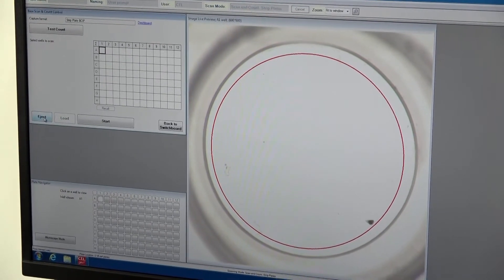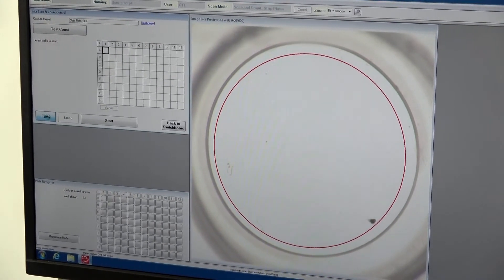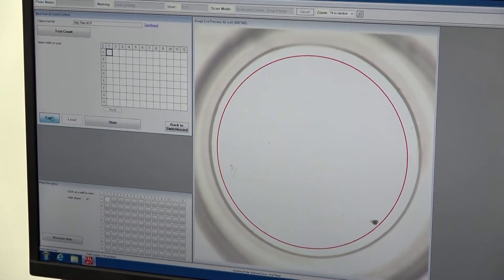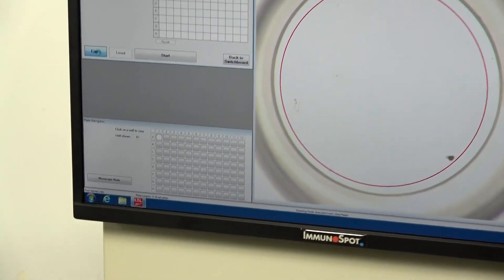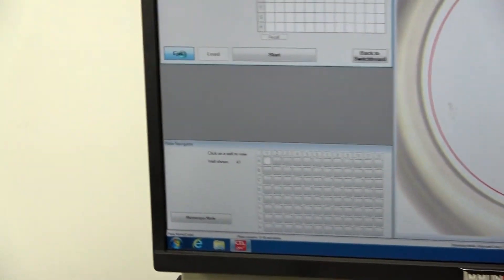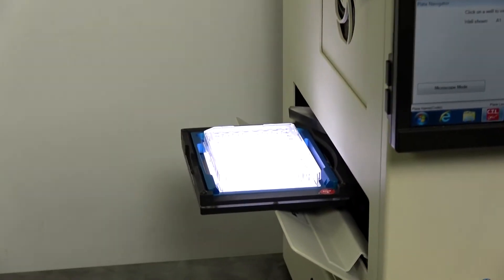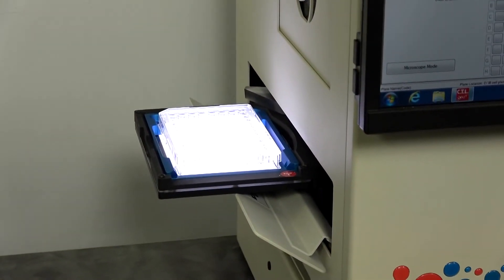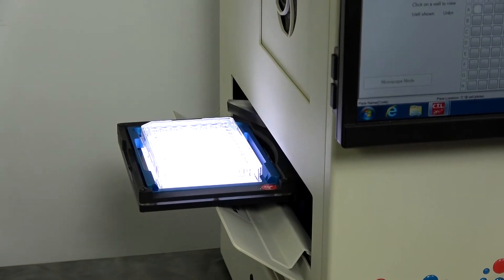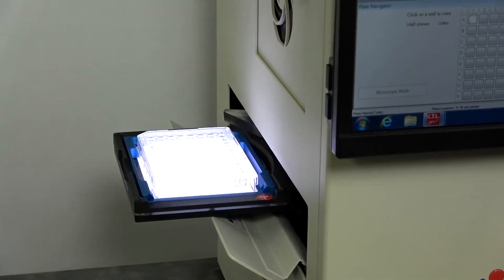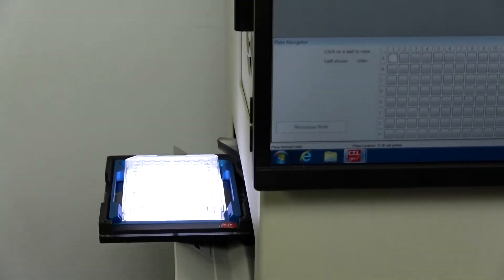While we're here, I'm going to eject the sample so you can see where the sample door is. It comes out. You can see it's got a lighted bottom. We're running a cover on this well plate.